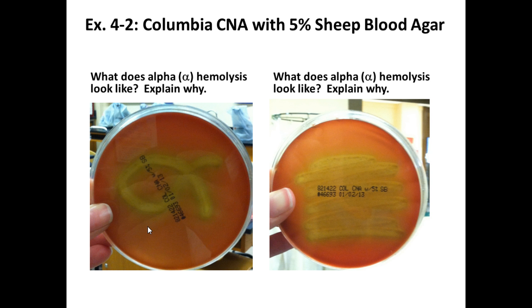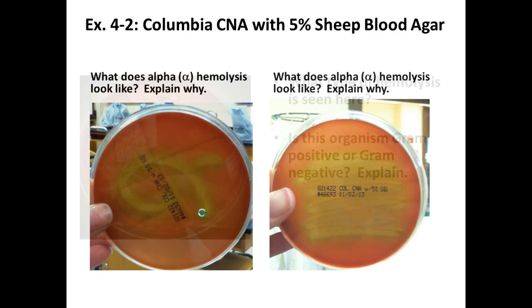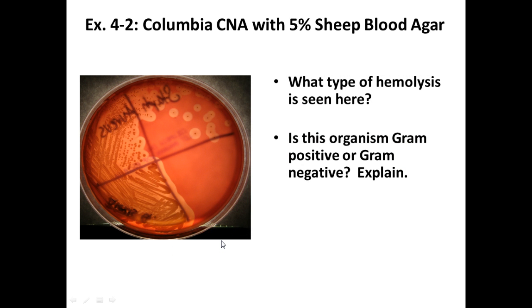They're greenish, right? Do you guys see that? And hopefully you see it even better on the plates that you have on your lab bench. This one, what do you think? This is hard to take a picture of. What type of hemolysis do you think we're looking at?